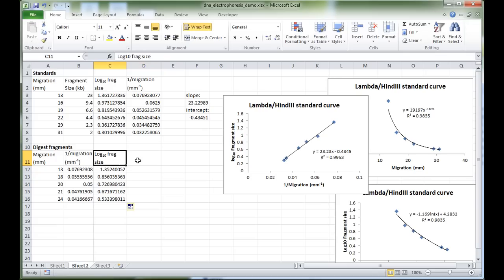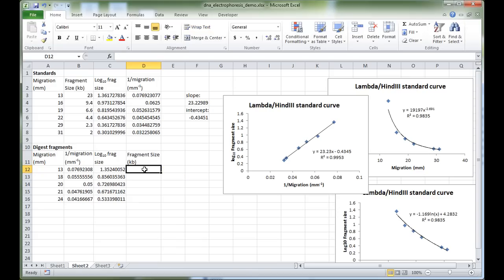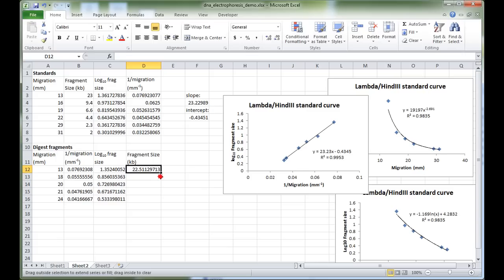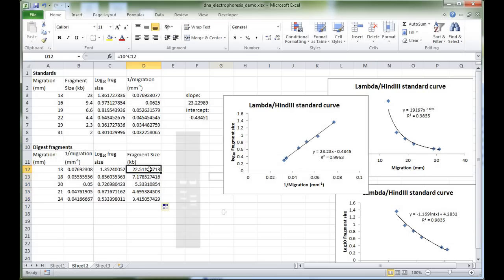Finally, to convert log₁₀ fragment size back into a normal fragment size in kilobases, we reverse the log₁₀ by raising 10 to the power of the log value: type '=10^' followed by the cell reference containing the log₁₀ value. The caret (^) is the power function in Excel. Press Enter and drag down — this gives the fragment size in kilobases.